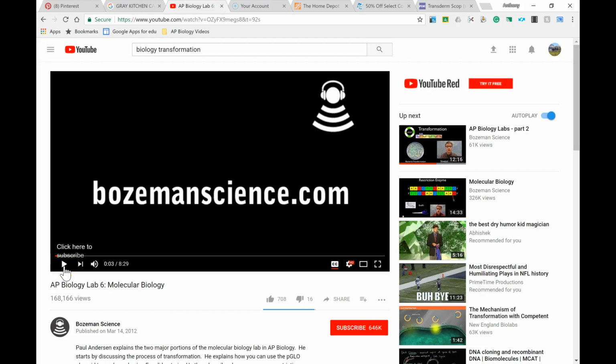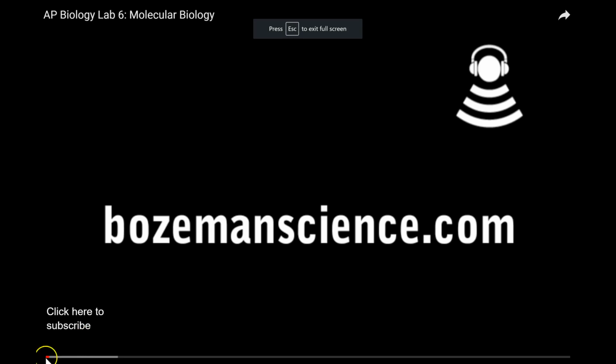All right. So first, we're gonna watch this little background. It's like we're gonna watch 3 or 4 minutes of it. Ignore the parts on gel electrophoresis because we obviously did not do gel electrophoresis, but we will later.